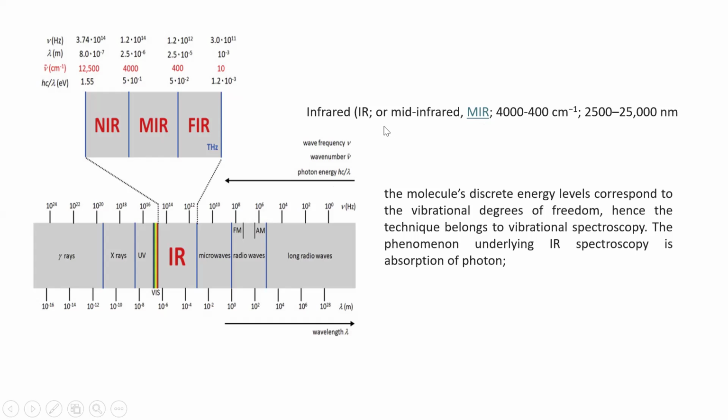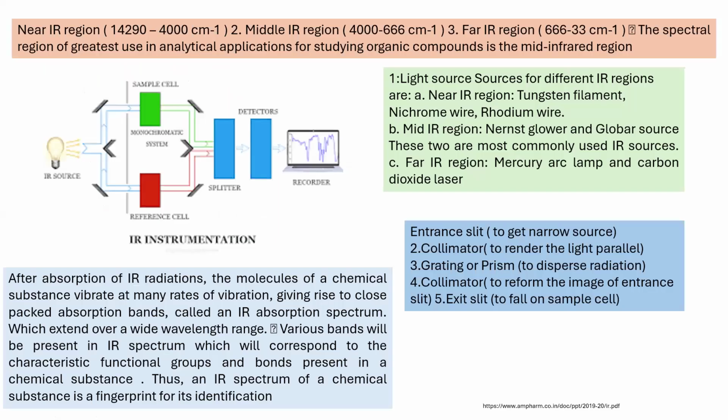Then you have the IR range, which spans 400 to 4000. Generally, when you are working with biological molecules, this range is scanned over 400 to 4000. It is not that a single wavelength is chosen and you keep it and take the absorbance. Generally, the entire range 400 to 4000 is scanned to get insight about the functional groups attached or the type of bond present in the molecule. How it goes, we will try to understand.